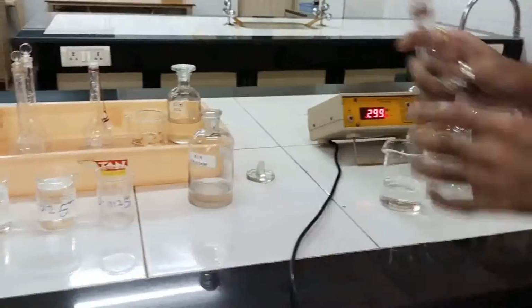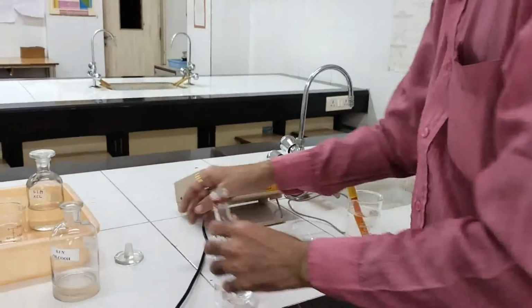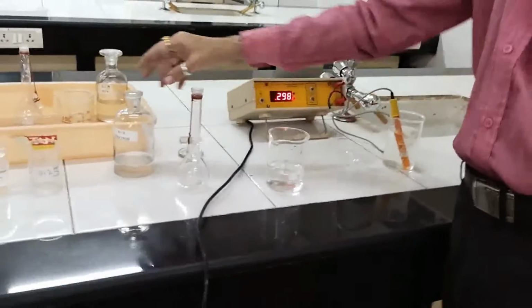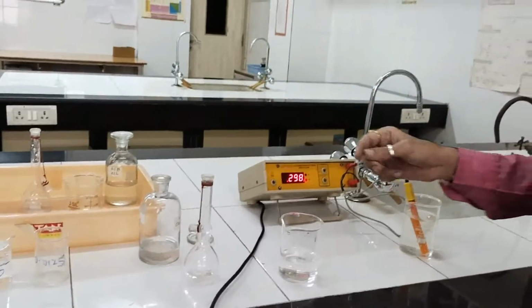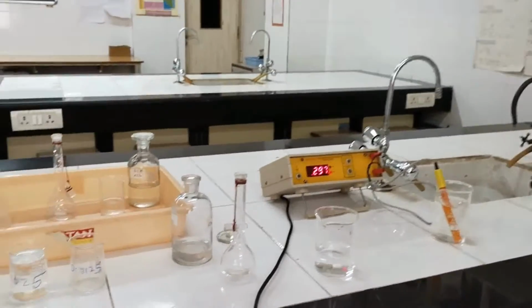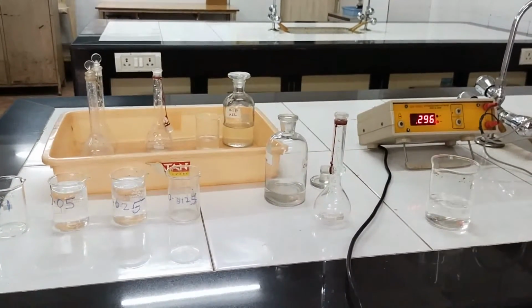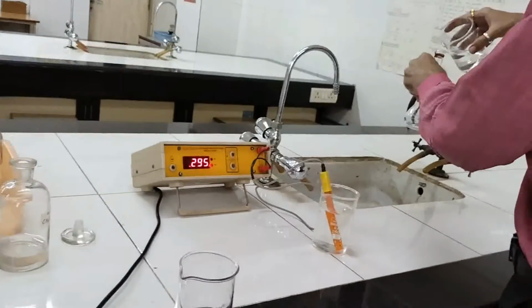Alright. So now we go into the last one. The last part that we have is going to be 0.0125. So for this purpose, what we have to do is, we are going to take 12.5. We are going to take how much? Only 12.5. Wash this with some conductivity water.